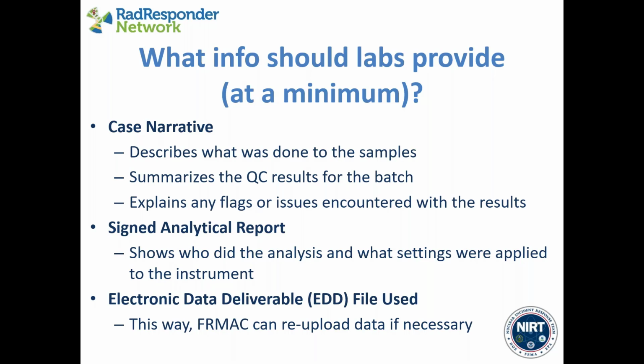The last, probably the most important thing, is the electronic data deliverable file. So that's the Excel file filled out with all the analytical results that we're going to import into RadResponder that will eventually make it to the database and be used by our dose assessment scientists.